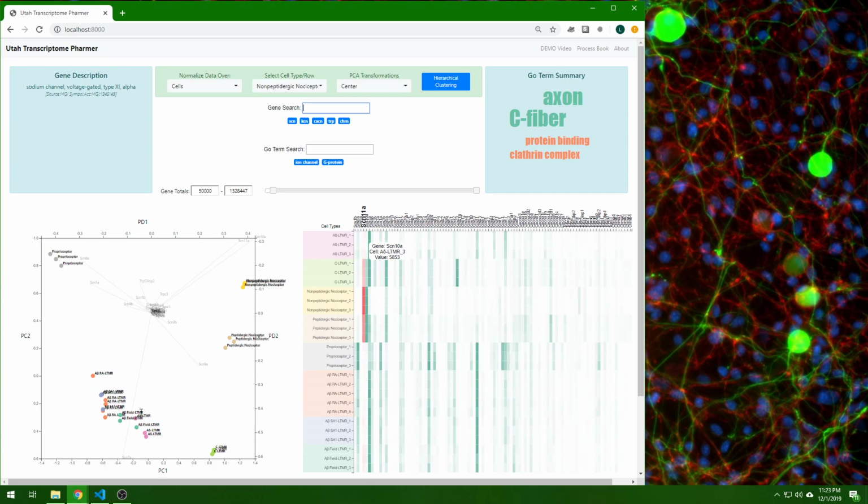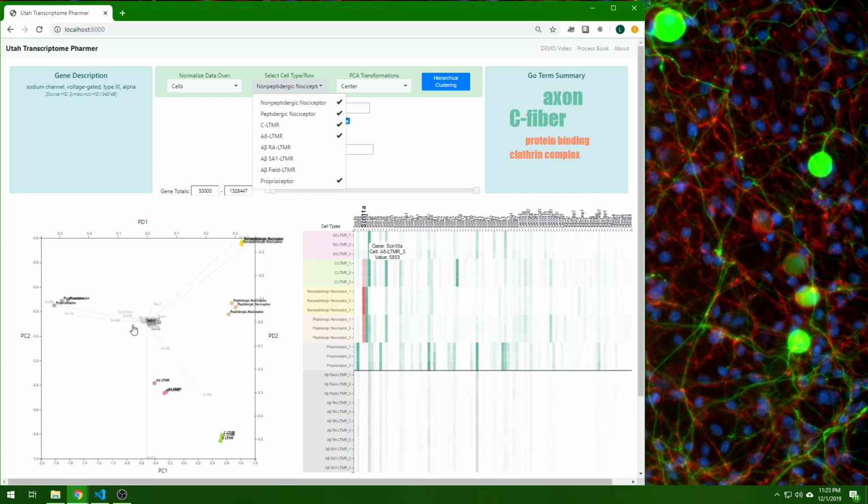We still have this cluster of points down here, so we can simply get rid of them to see how well this data separates. As I click, these neurons go ahead and are removed. And now we see that these cells are very well separate. Sodium channel 9A separates low threshold mechanosensing cells from everything else.